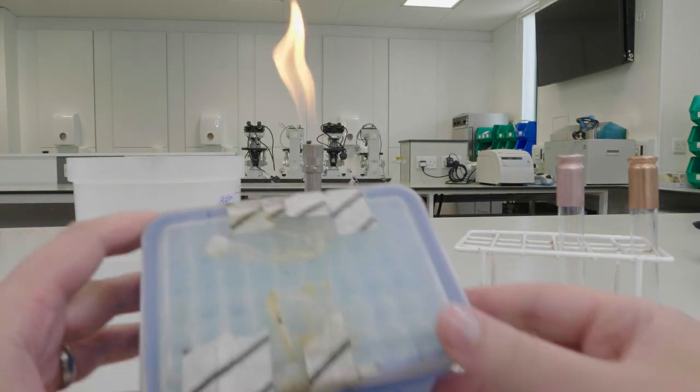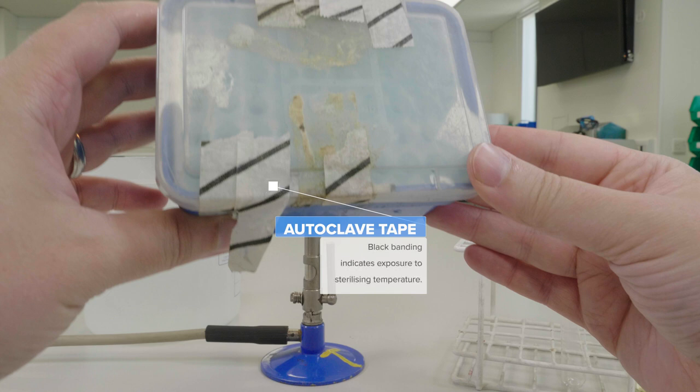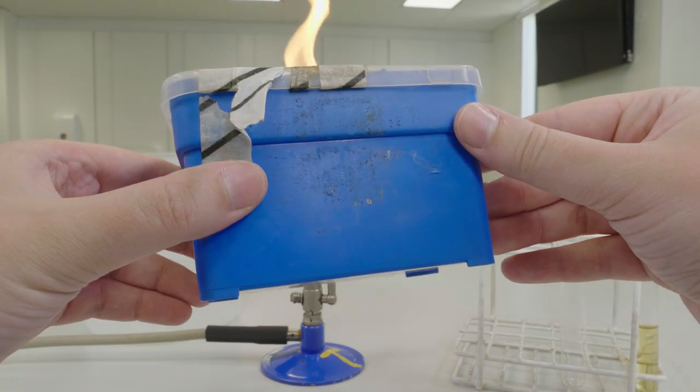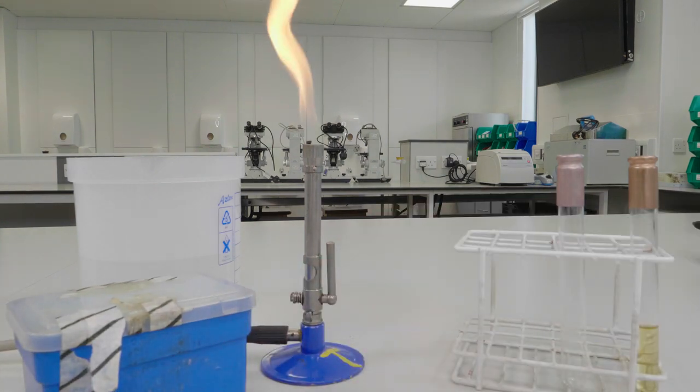You also need some sterile pipette tips. You can tell your tips have been sterilised as they will have some autoclave tape stuck on them. Do not use tips if they don't have autoclave tape on them. They might not be sterile and could end up contaminating your work with environmental organisms.